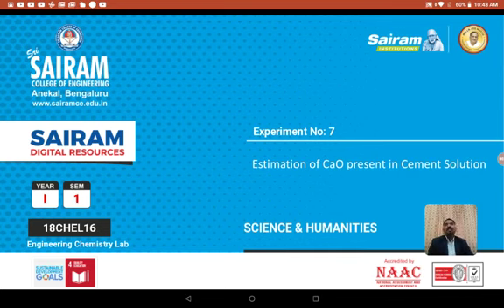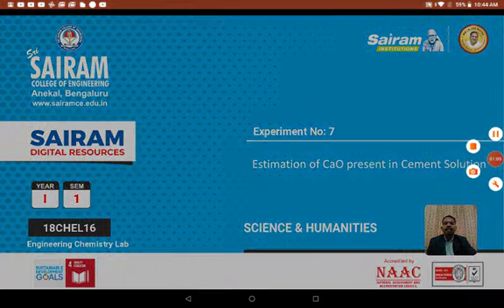So what do you mean by complexometric estimation? In any estimation, if you are using EDTA as the titrant, such estimations are called complexometric estimations. So today let us see how to estimate calcium oxide using EDTA.